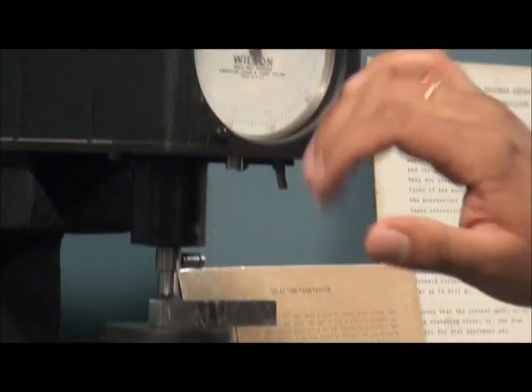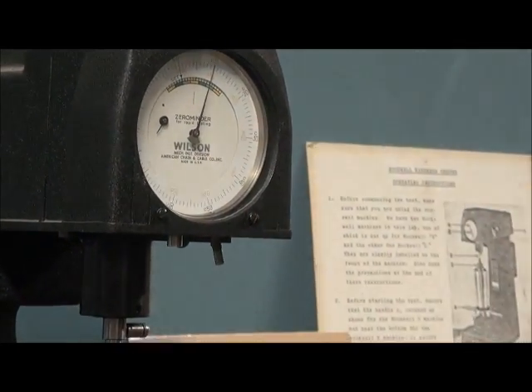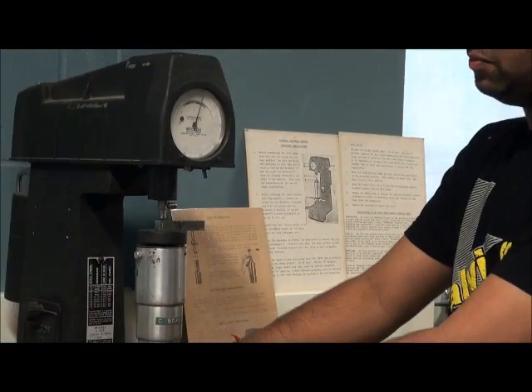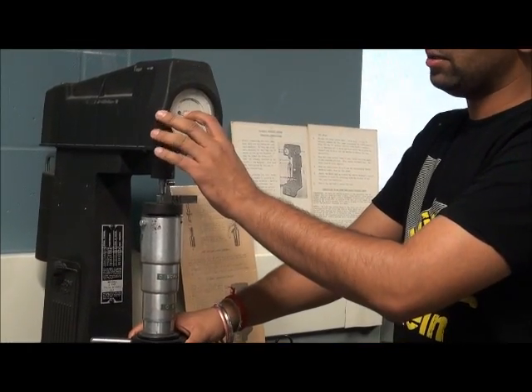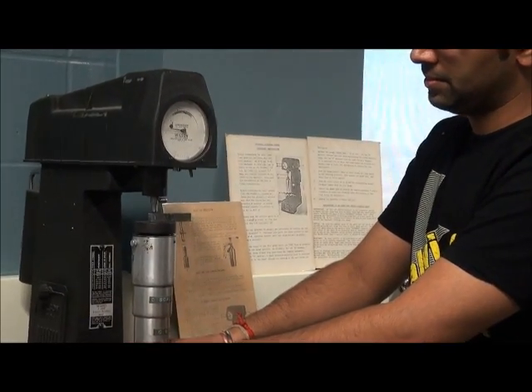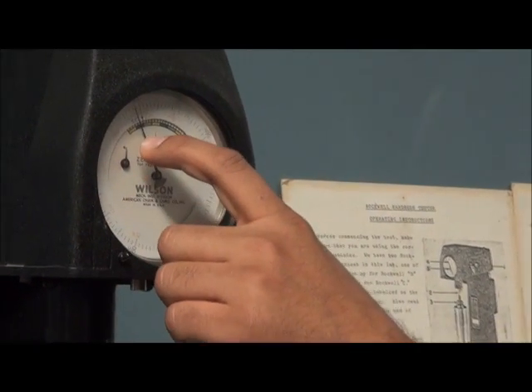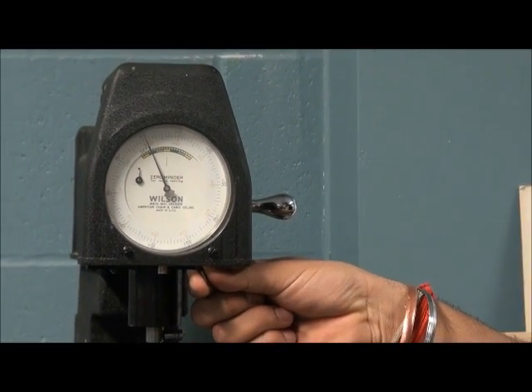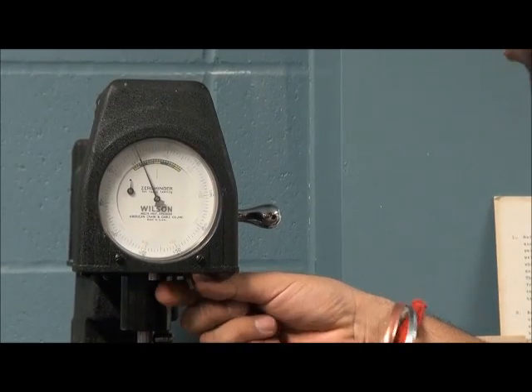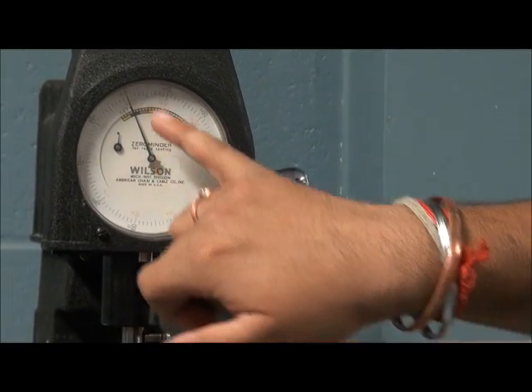Now, on the dial there are two needles, one is small and one is big. When we move this wheel, the small needle will move. And we have to move the scale until the small needle is pointed towards the black dot. And now we can see that the small needle is pointed towards the black dot and the bigger is pointed towards the zero.